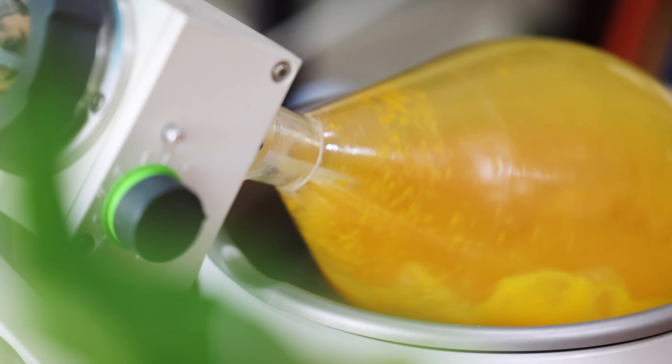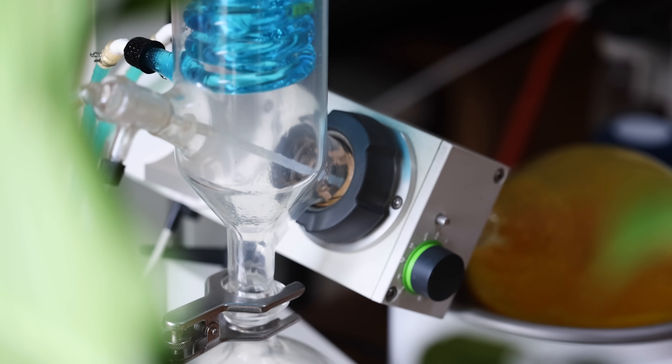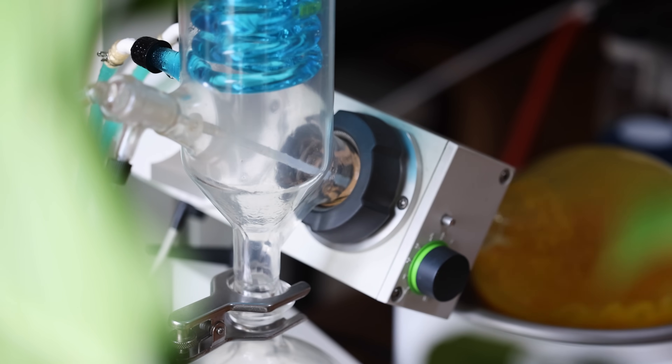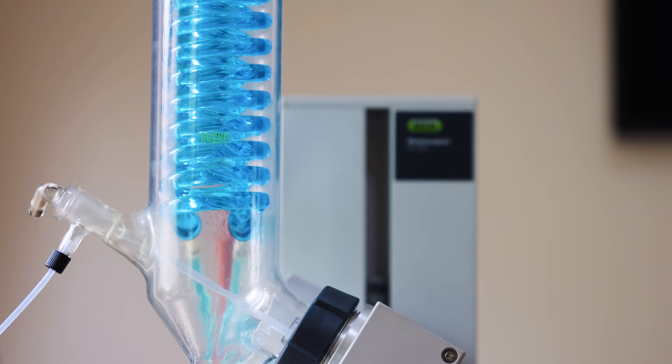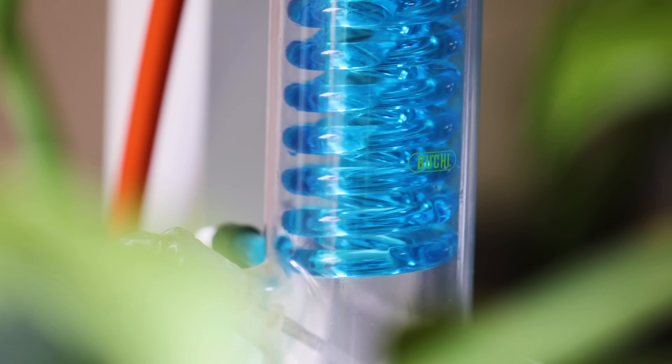The liquid that's evaporated from the flask travels up through the Rotavap to the other side, where it condenses on chilled coils. Normally I have my condensing coils chilled down to minus 10 degrees Celsius, and I'll talk a little bit more about that in a moment.